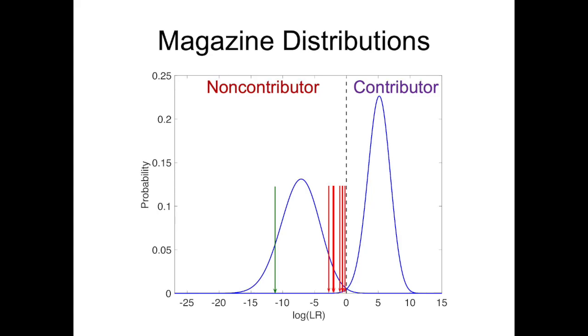And it's just not relevant. And the judge saw that. And TrueAllele was found to be reliable because equating very small LRs with very large LRs and ignoring these distributions and error rates is not modern science.